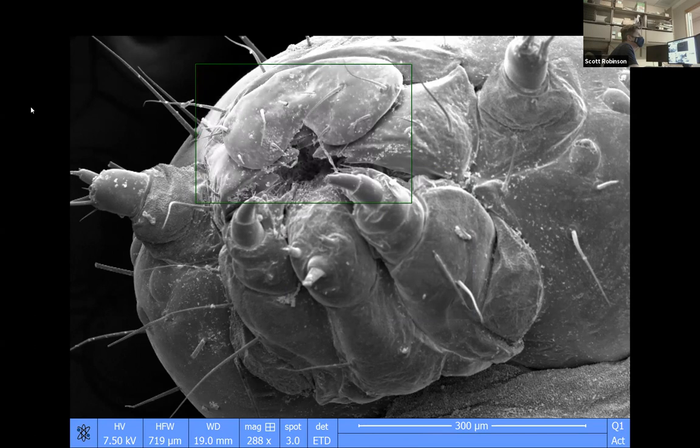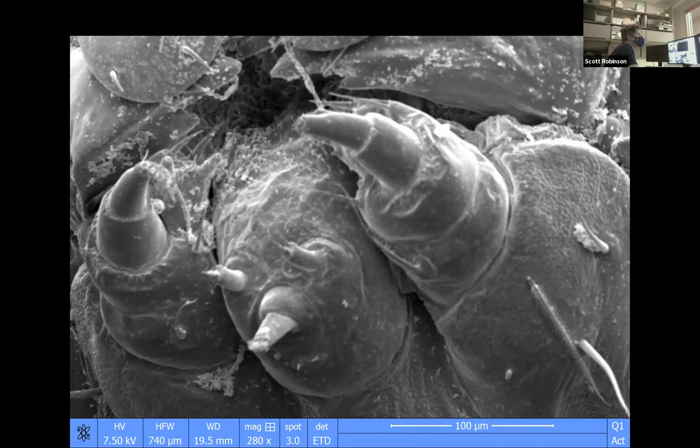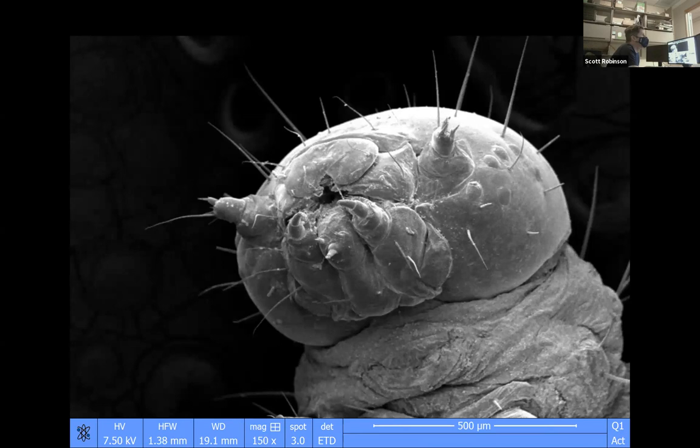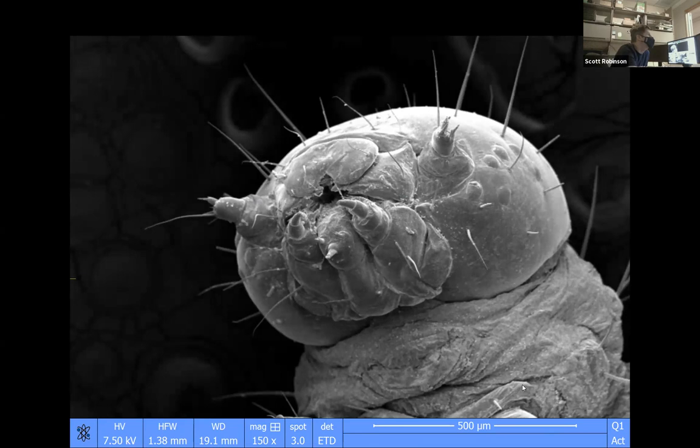It's all labrum. I know in ants, in addition to the labrum, they also have a structure called clypeus, which is like the front part of the head. On the head of the caterpillar, we can see this little disc-like thing, and the disc-like thing is the clypeus, I think. I'll bring up a diagram of caterpillar head anatomy real quick and see. Yeah, and then I'll be wrong.